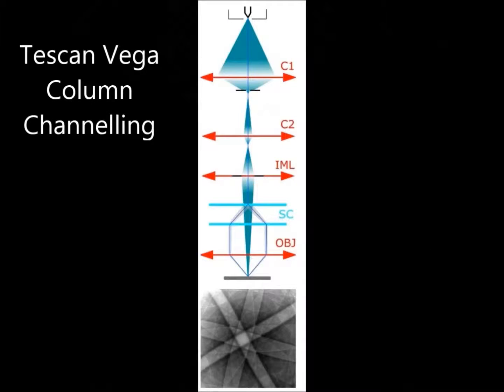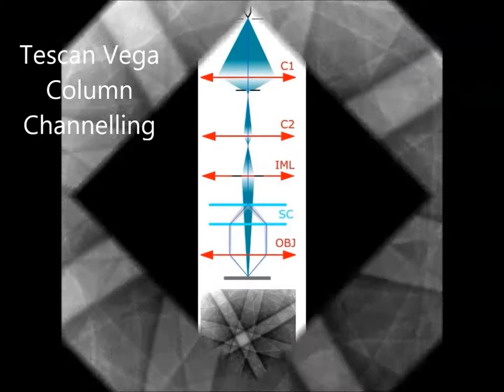Last but not least is channeling mode. In channeling mode, the scanning and the lens focusing are controlled so that the electron beam impinges onto one point of the specimen surface all the time. By means of the scanning of the beam, only the angle of incidence of the beam is changed. The resulting image is the amount of electrons depending on the impacting beam angle.